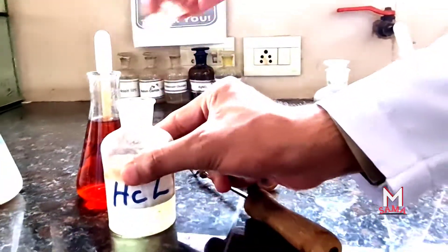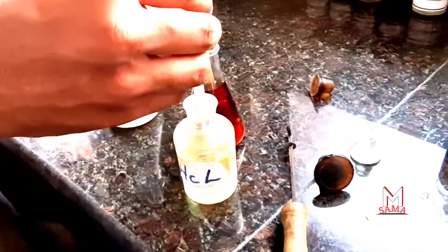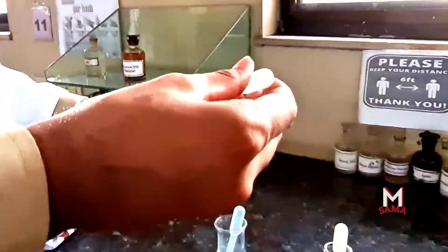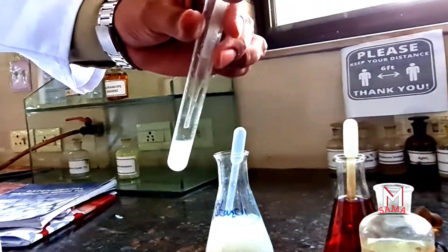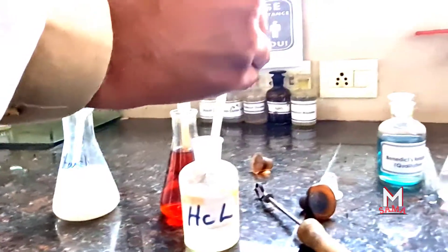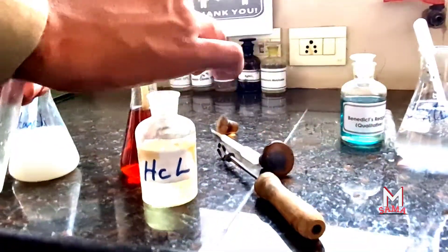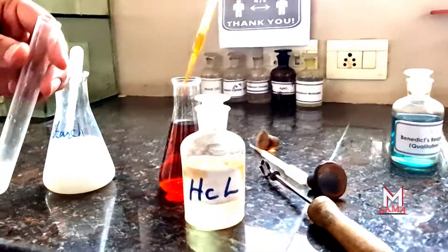Now add one drop of HCl because iodine only reacts with starch in acidic medium. So we will add one drop of HCl in this test tube to make it acidic. Now we will add one drop of the iodine solution.